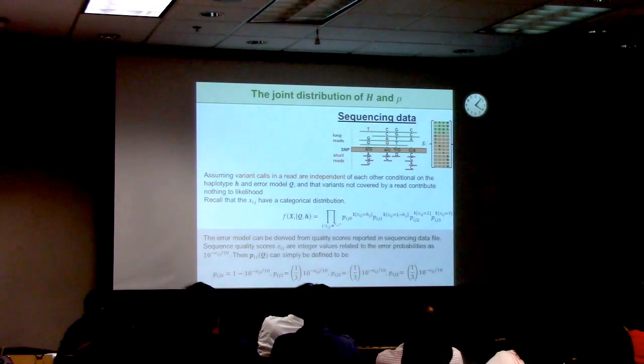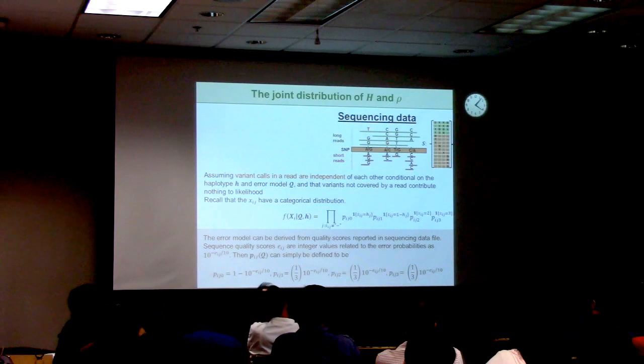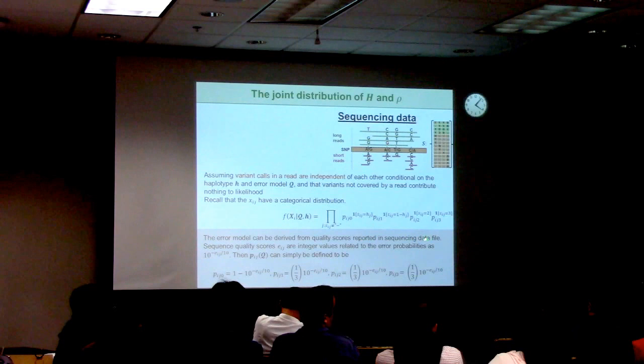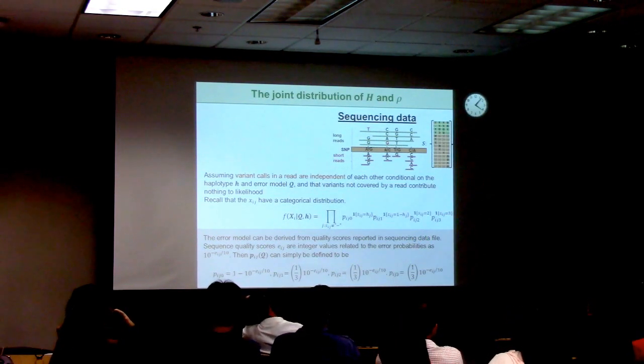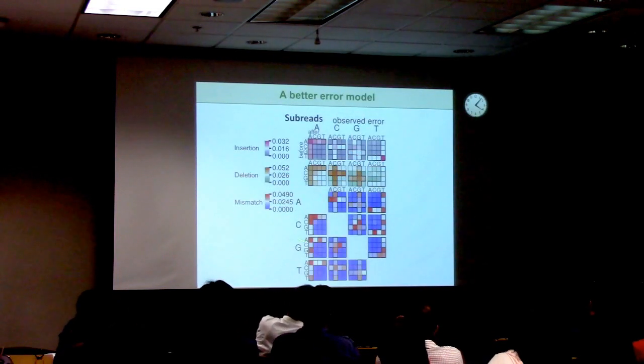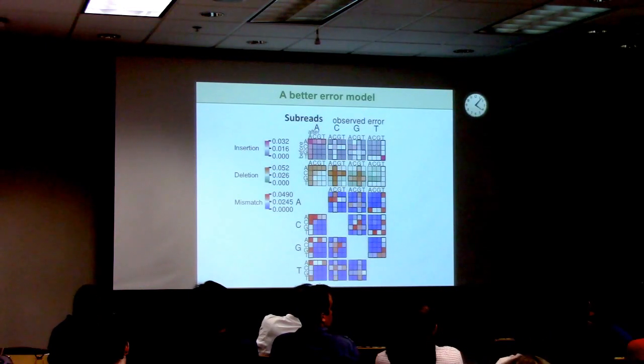Right. In the simple way, we can estimate the Pij from the estimation of the error. Given the base call, we have an error, how likely is it not true. You can calculate it from the sequencing quality score and then split it evenly to the other 3 nucleotides. However, we have a better model. Remember, Align QC gives you an error pattern like this. If you check this carefully, you find that if you have an error rate, you cannot split it evenly to the other 3. So this is a finer error pattern you get from the real data. This is generated by our tool Align QC.